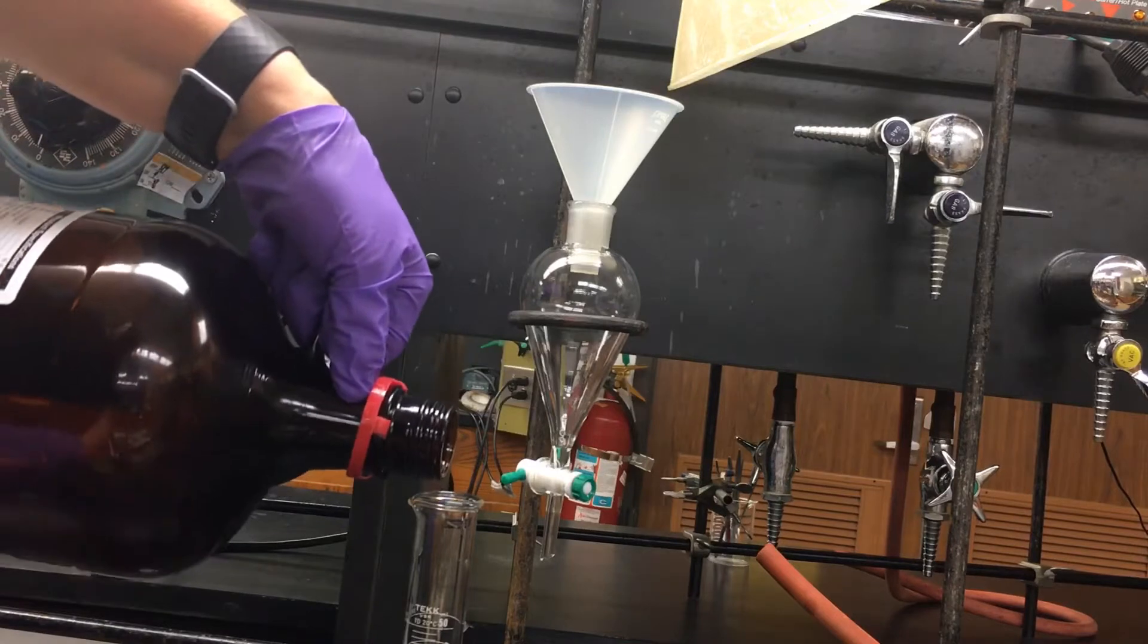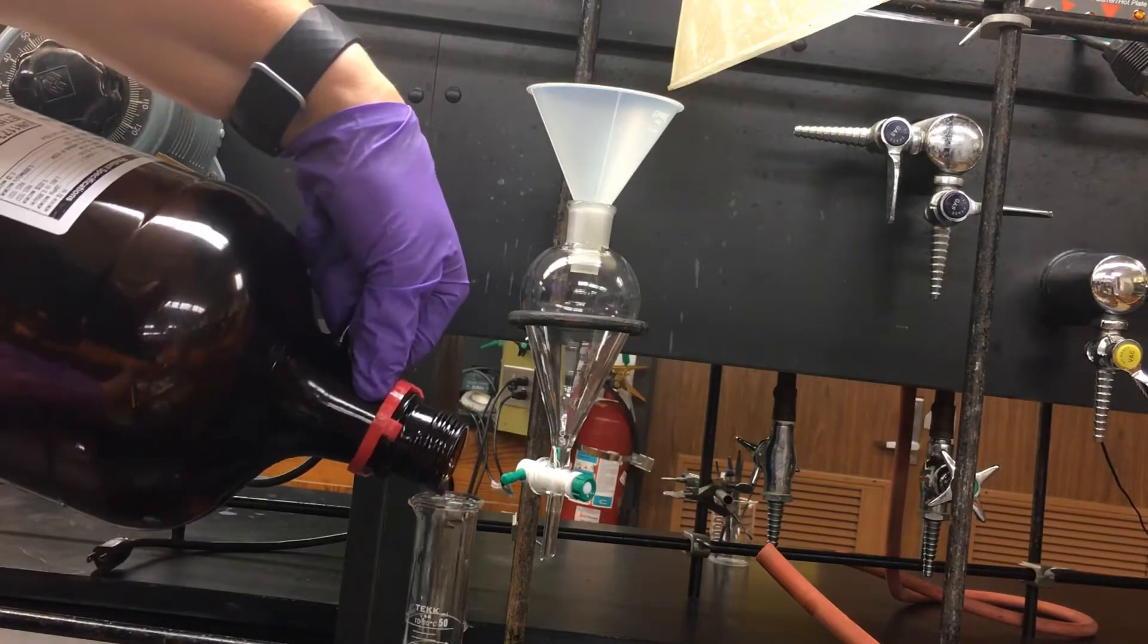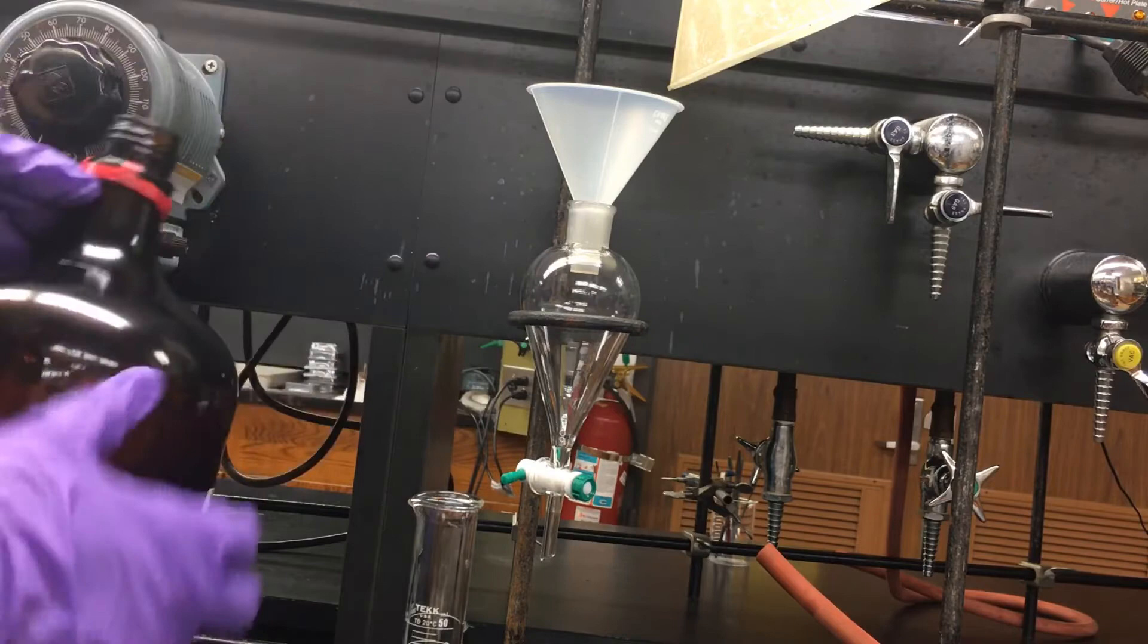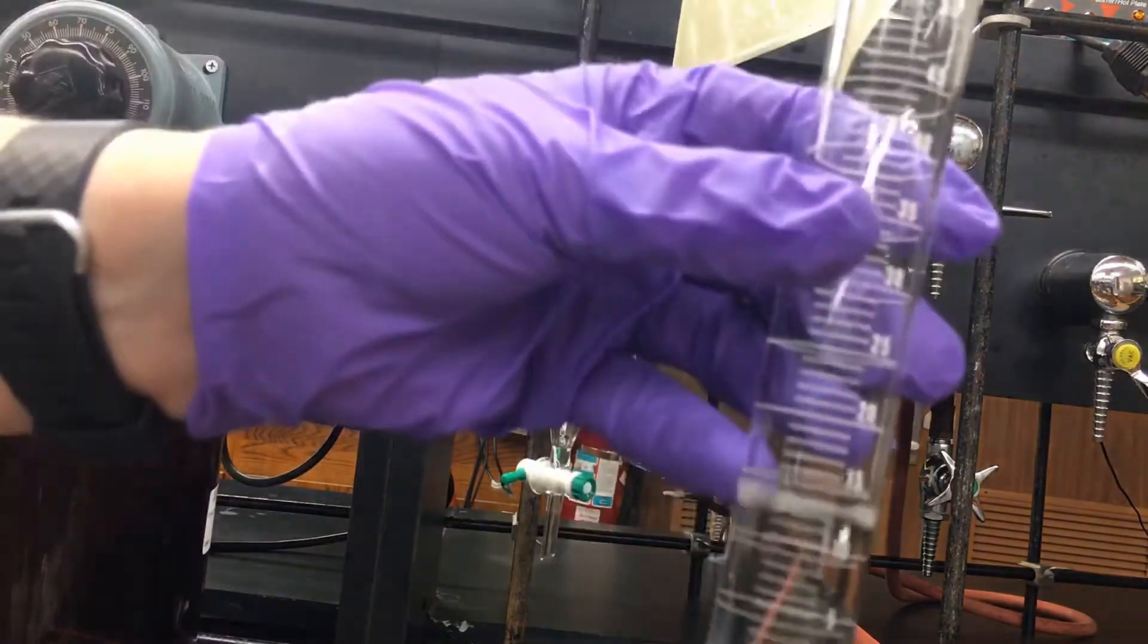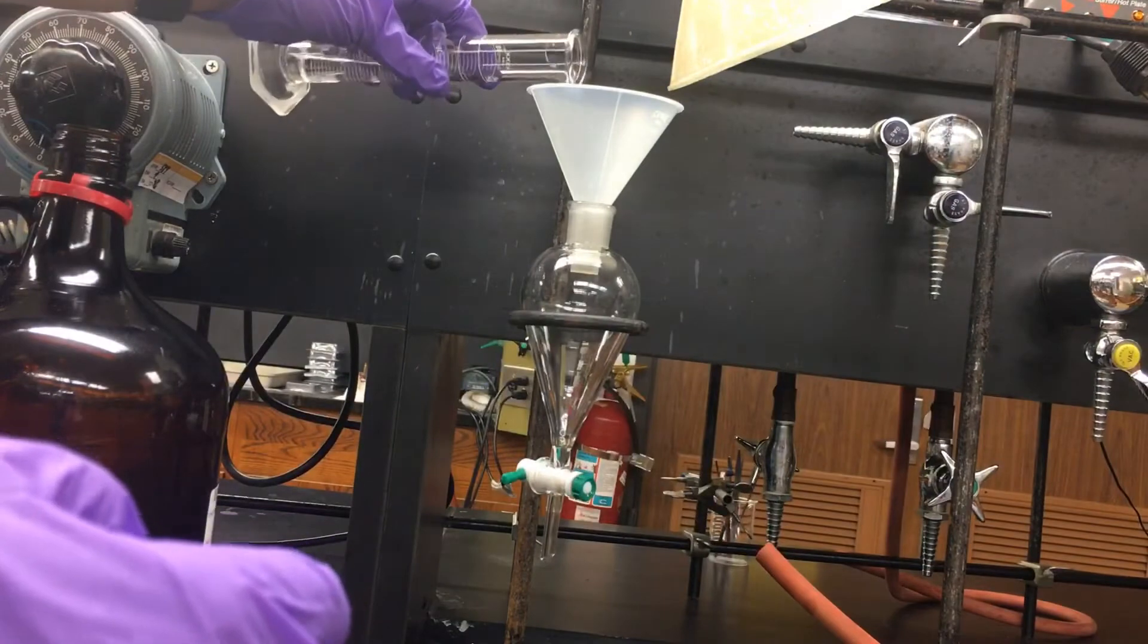I'm now measuring out 10 mils of ethyl acetate. This will be poured into the funnel from the top. You can see it's about 10 mils now.